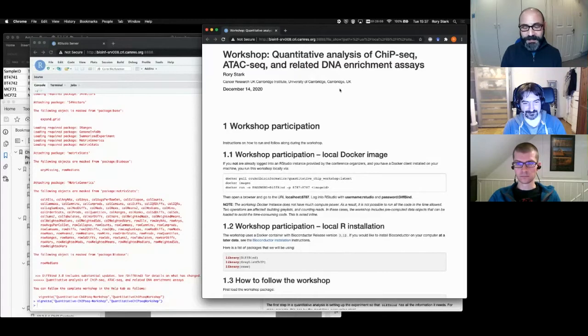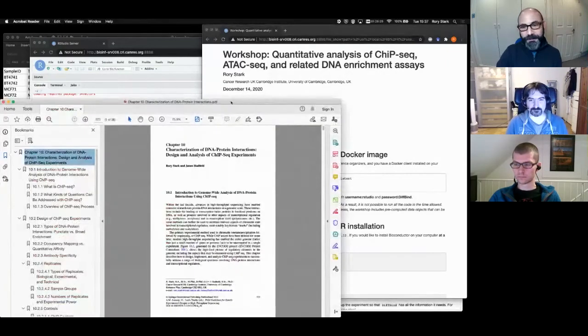And we end up basically chopping it up into a bunch of pieces, purifying it, sequencing it, and then basically counting it. So it's a counting assay, and that's really where we're going to come in, is really doing the counting and comparing.